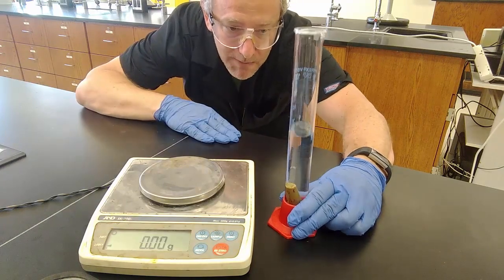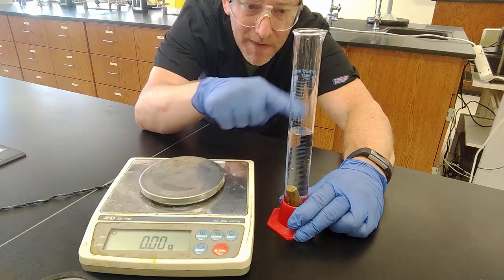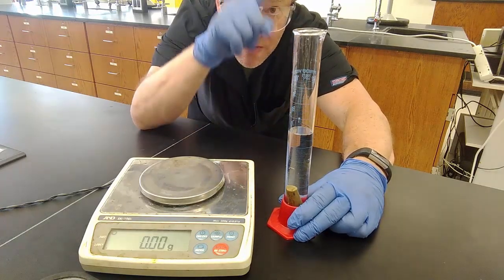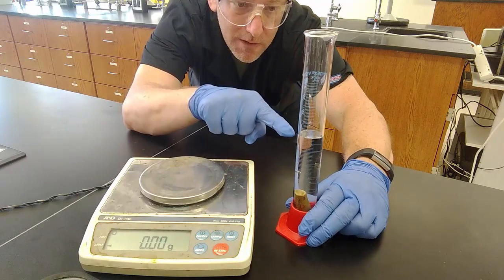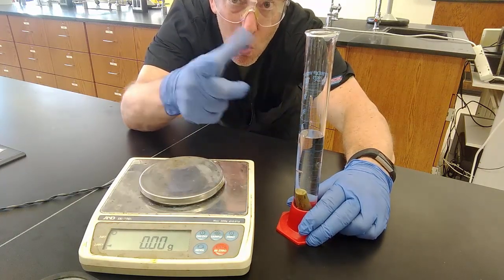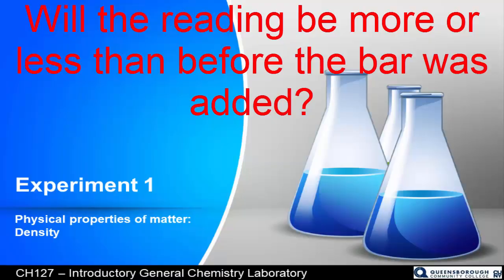You'll learn this in a much later chapter. Water adheres to the glass with stronger forces than it coheres to itself, and so that's why you have a U-shaped meniscus, it's called, at the top of the water. If this were mercury, it would be toxic, and we wouldn't do that. It would be an inverted meniscus because mercury's cohesive forces are stronger than its adhesive forces to glass.